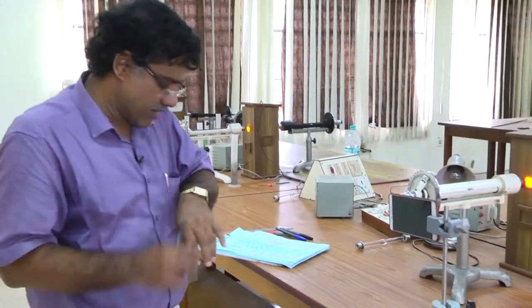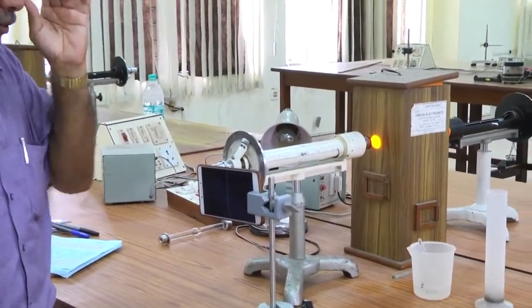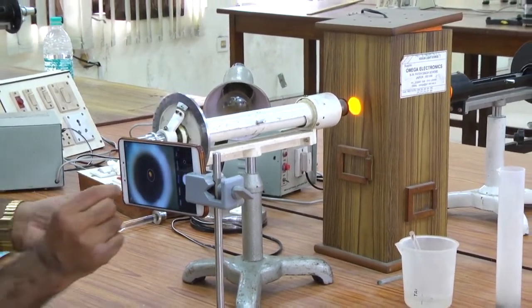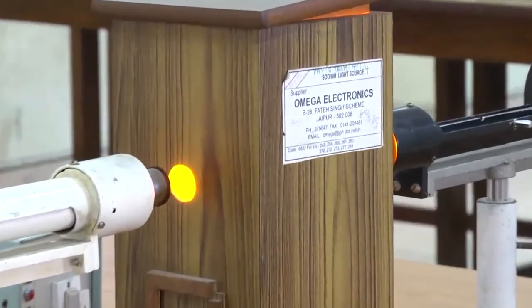So, this is the experimental setup of polarimeter. Whatever I told, I think again I have set the camera.